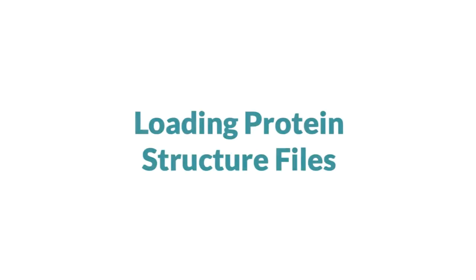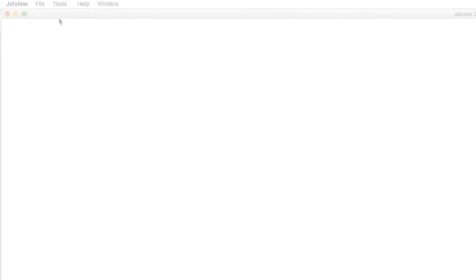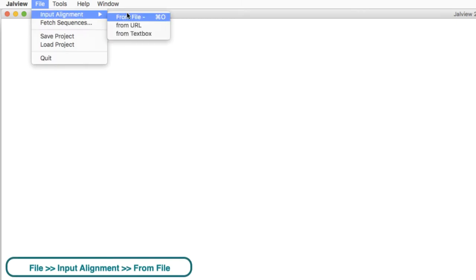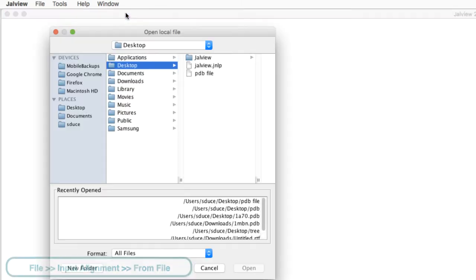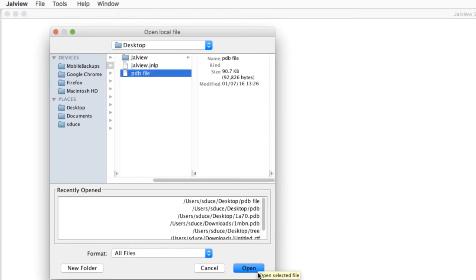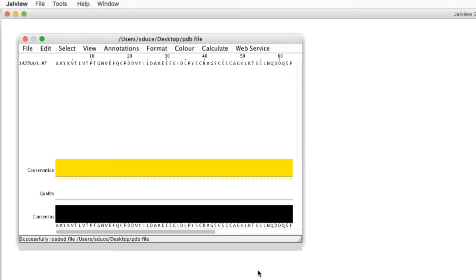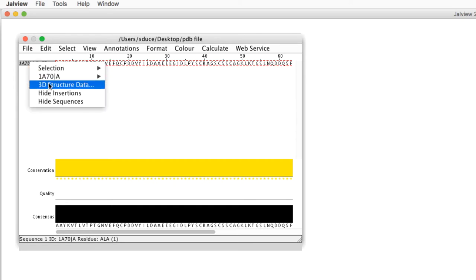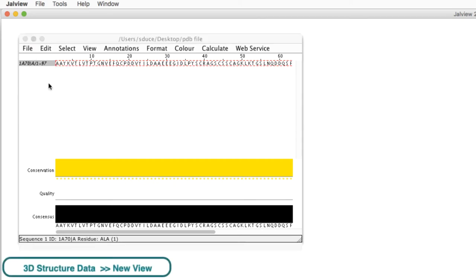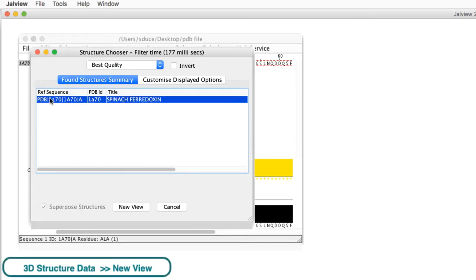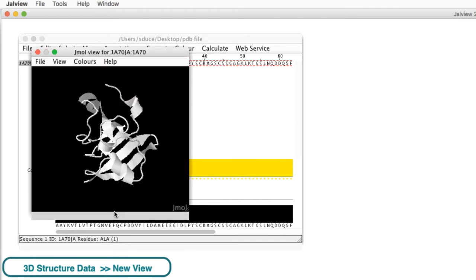There are several different ways to access protein structures in Jalview. Jalview can load protein databank format files directly. By going to the File menu, select Input Alignment from File and select the PDB file. In the alignment window select the sequence, then right-click the mouse to open the context menu. Select 3D Structure Data and this opens the structure chooser dialog box and click View.